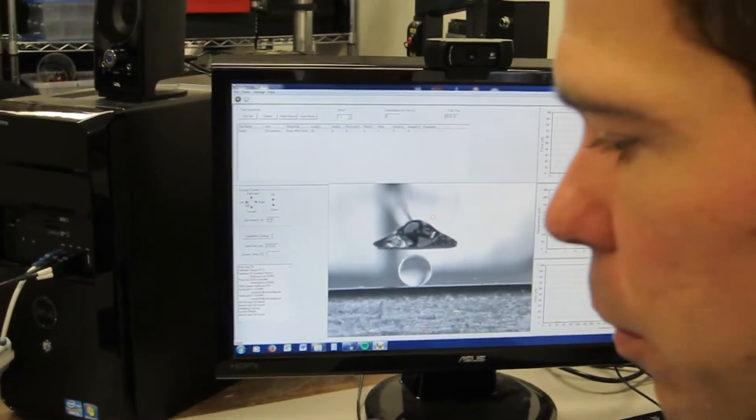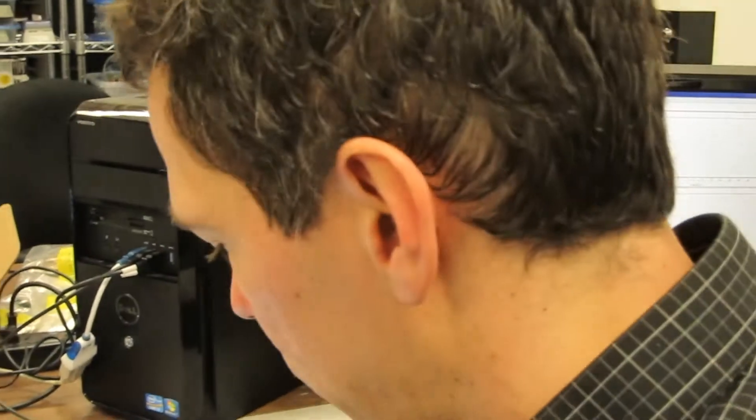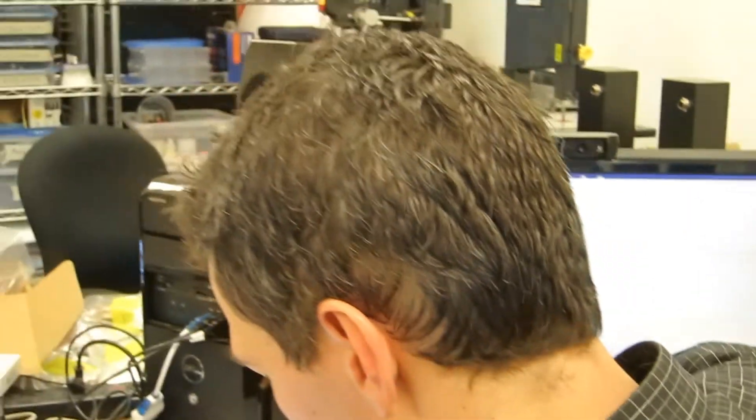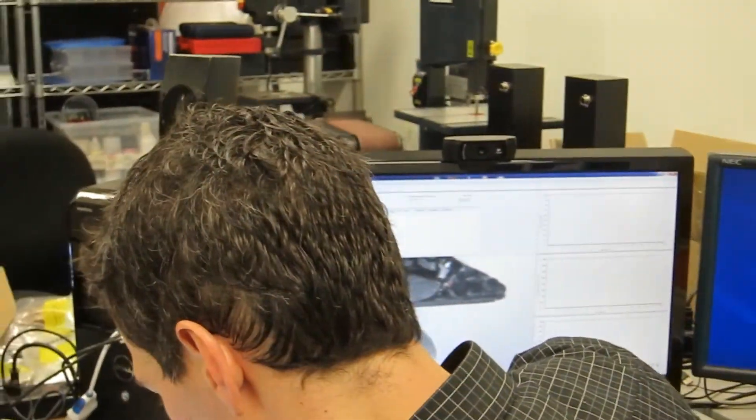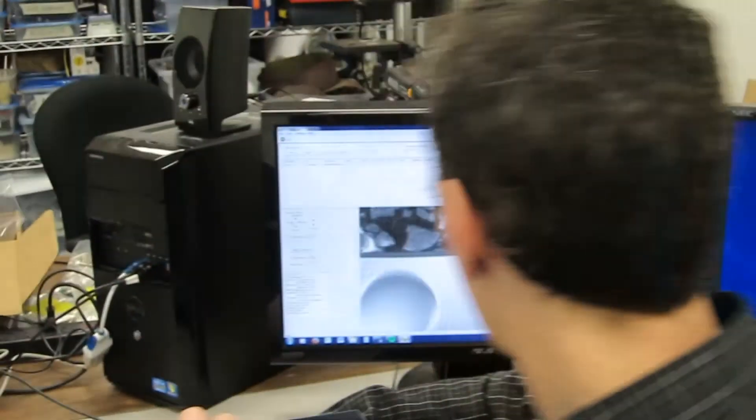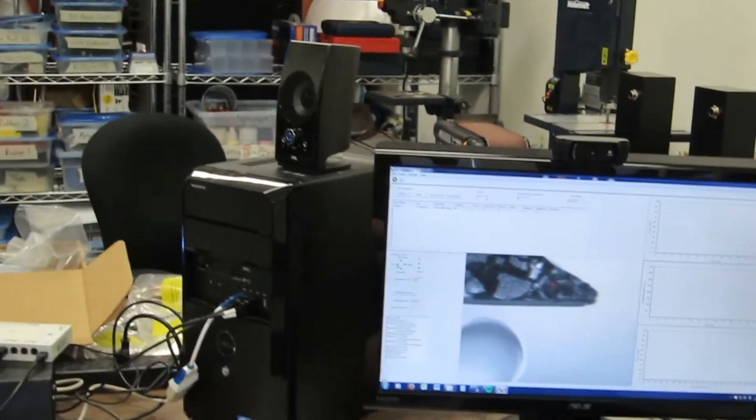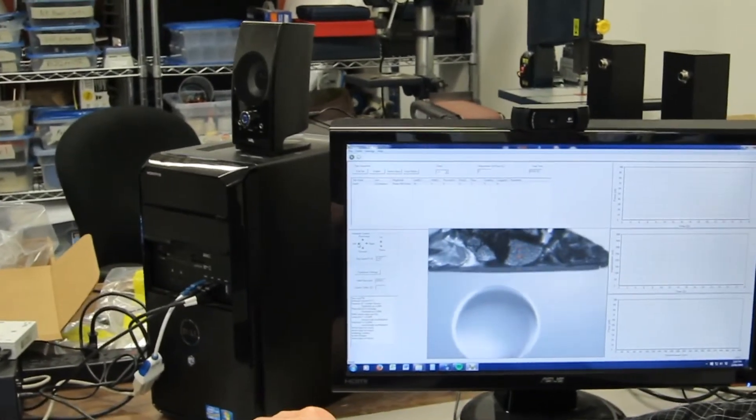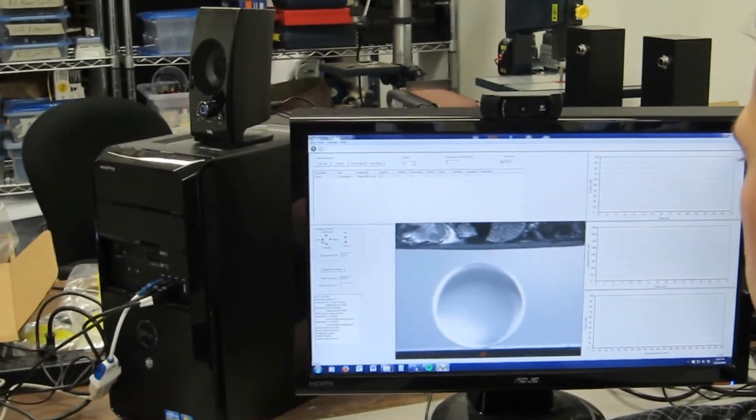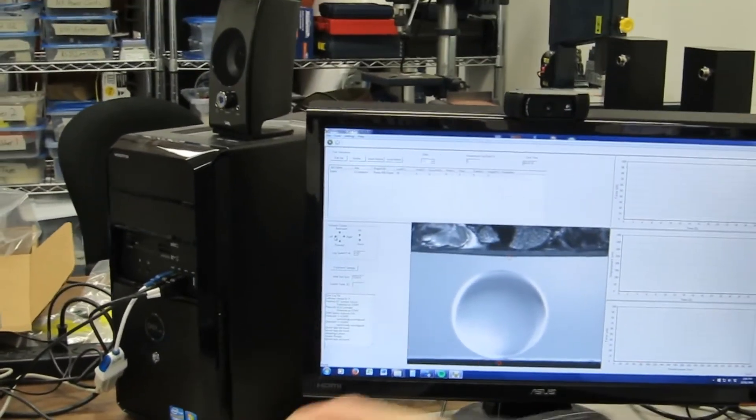Then I'll fix my optics on a suitable zoom level and move them around so I can see exactly what I want to see in the middle of the frame.